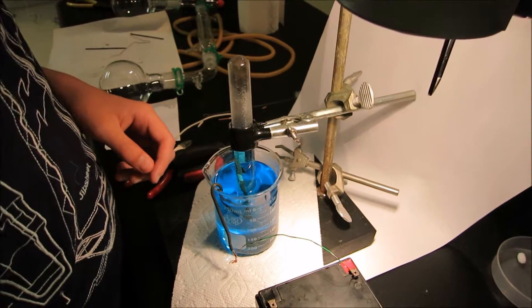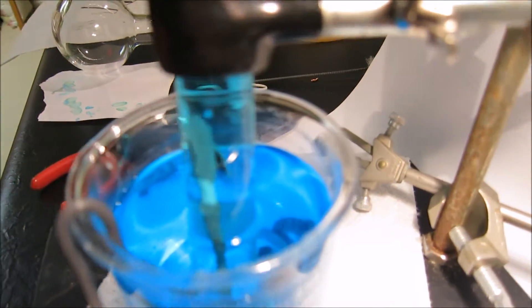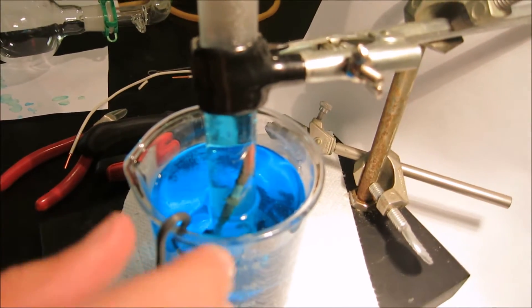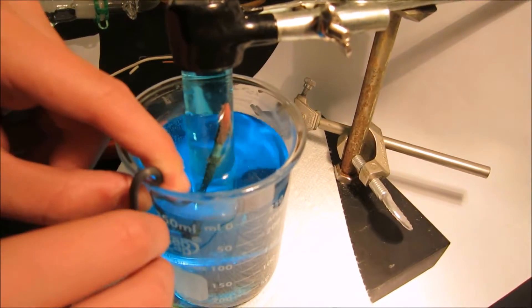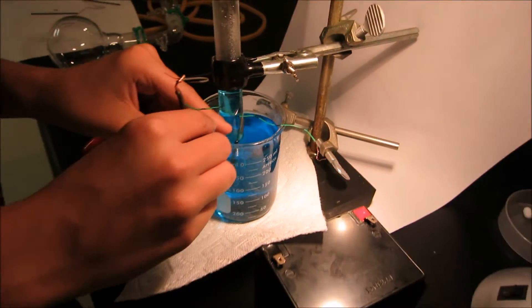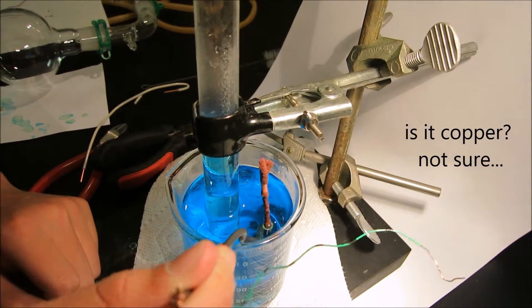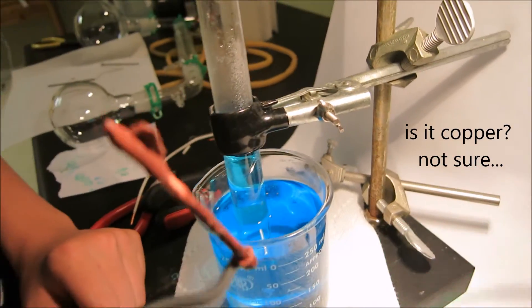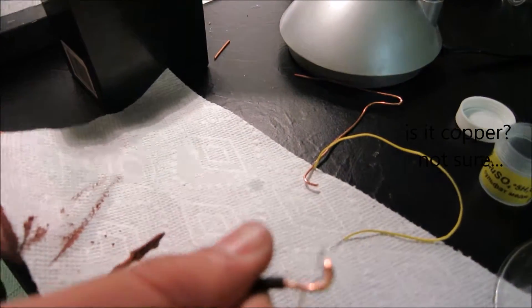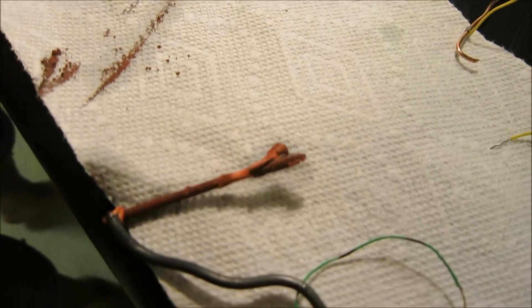Let's take the other one out and see what happened to that nail. Wow — so this is copper as well. Let's wipe this off. That's quite a lot of copper.